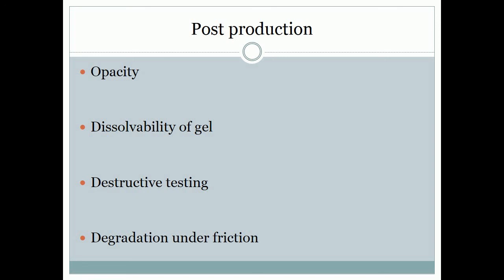The instrument compresses the capsule for 20 seconds between a plunger attached to a load cell and a platform which is raised. During the test, the platform rises automatically and the load cell indicator displays the value of the resistance of the capsule to the compressive force. After 20 seconds the test is completed and the value displayed represents the hardness of the capsule under test. A hardness of greater than 12 newtons indicates that breakage through embrittlement of the capsule may be expected.